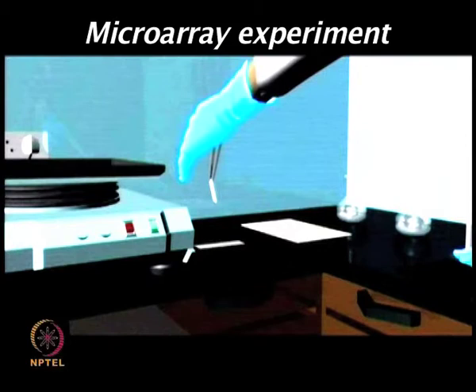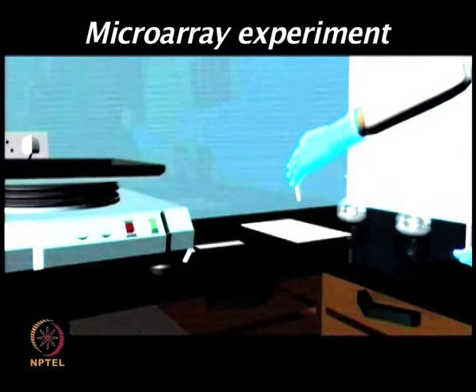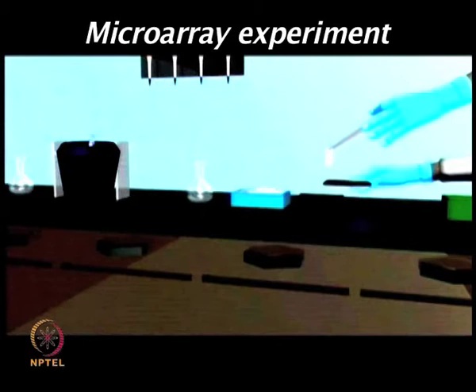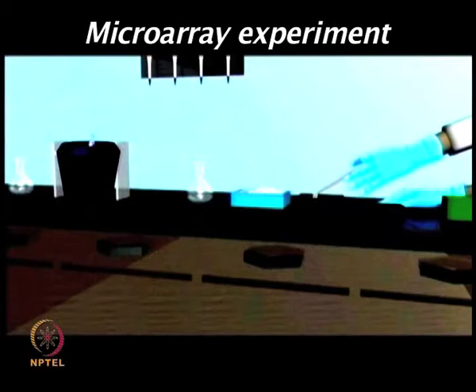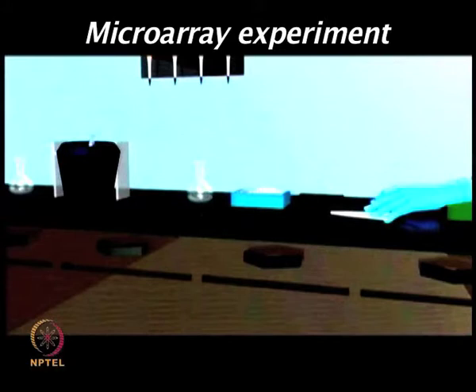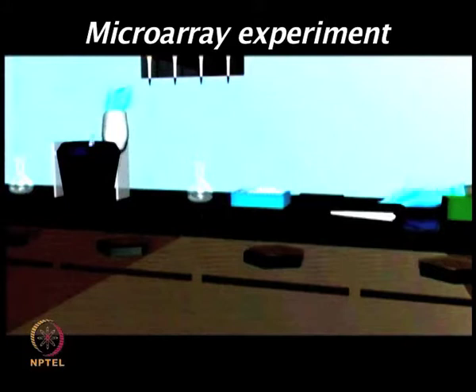Now in a typical microarray experiment, regardless of your application, one needs to perform a certain set of steps which are quite generic, and then depending upon the requirement, one can make changes and optimize the conditions for those experiments. So a typical experiment includes a primary antibody, where one can use anti-query proteins if you are looking for protein-protein interaction, or one can add the patient serum, which we are going to show you in this one, for immune response detection. And then a marker-linked secondary antibody, which is usually the HRP conjugated anti-mouse IgG or Cy3-Cy5 conjugated anti-human IgG, can be used for signal detection.